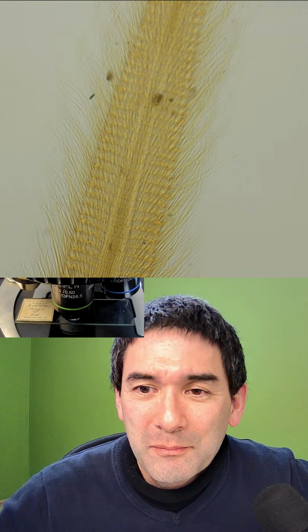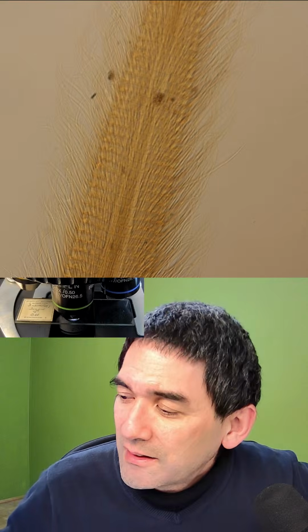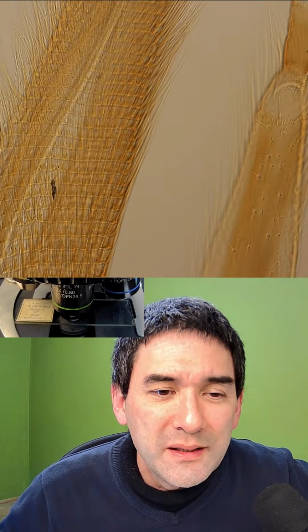So polarized, there was a request, I can do that. But with those prepared microscope slides, I've seen that sometimes the DIC effect is not quite as big. A little bit here.